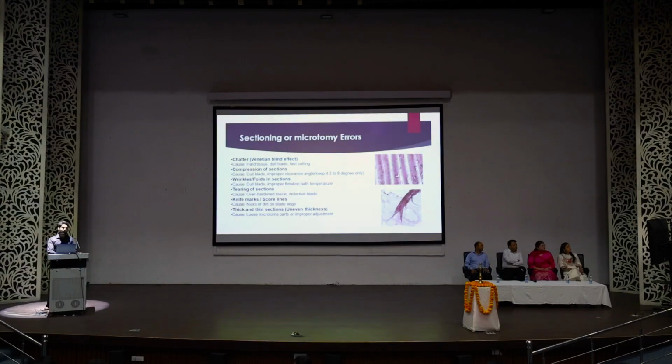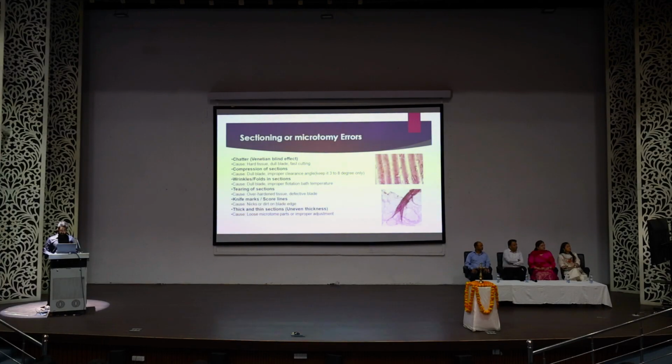Compression of sections is the other error we face. This is usually caused by improper clearance angle, which should be between 3 to 8 degrees, or because of a dull blade. It affects the microtomy and hence the reporting.